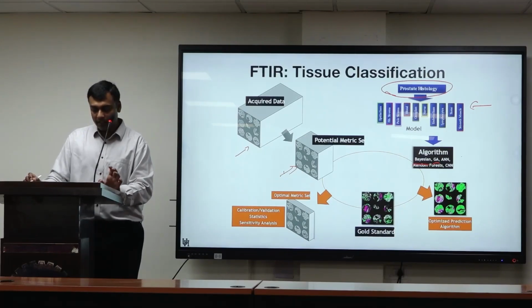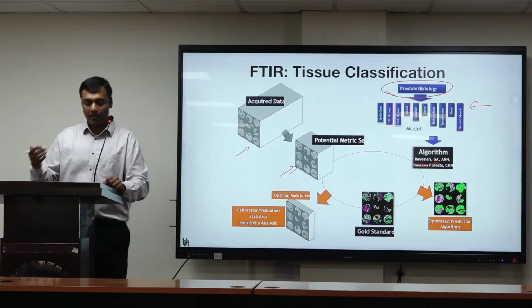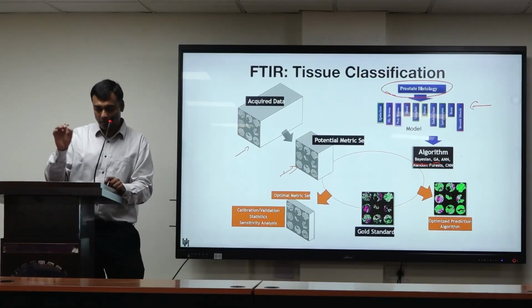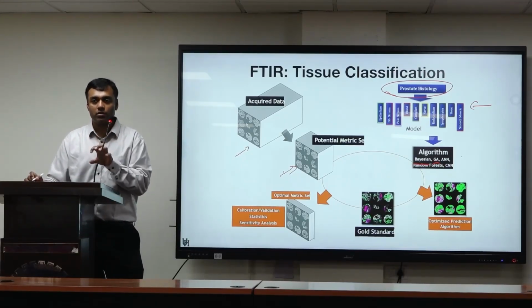But in any case, you optimize it and compare to histology. You have doctors who mark regions out and different subtypes, and we work with doctors who do this.